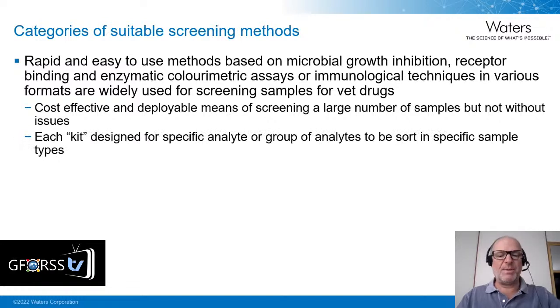Each kit is very, very specific. By that, I mean it is designed for a specific analyte or a group of analytes, and it is to be used for the analysis of a specific sample type.